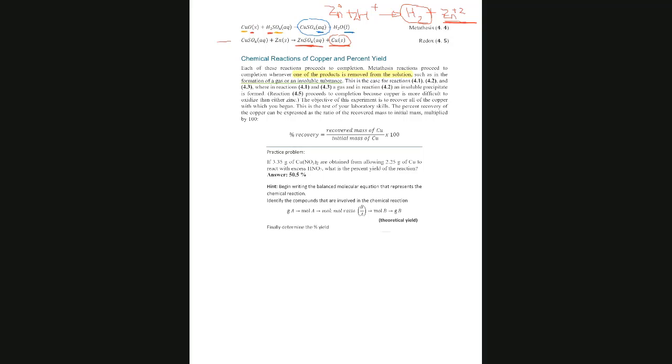And again, there is another question in the report. What are we removing or washing with the water? We are removing the solution of zinc sulfate. If you look at the last reaction, you produce zinc sulfate and copper. So we are only interested in the copper. So we remove in this step all the zinc sulfate. Any questions so far?